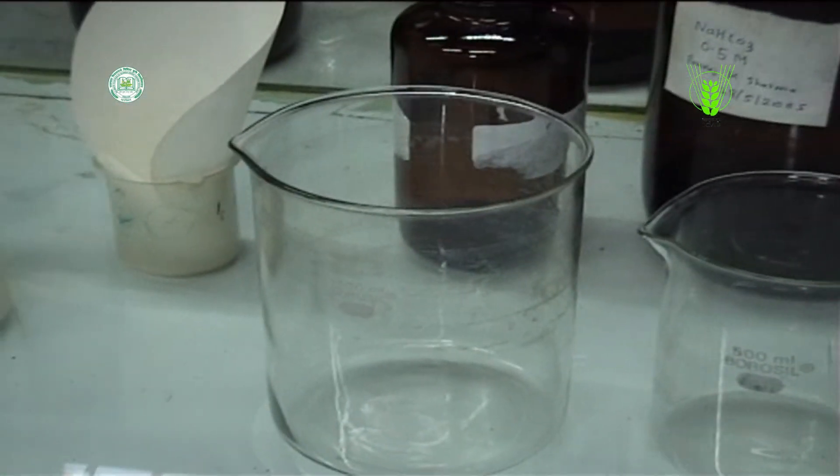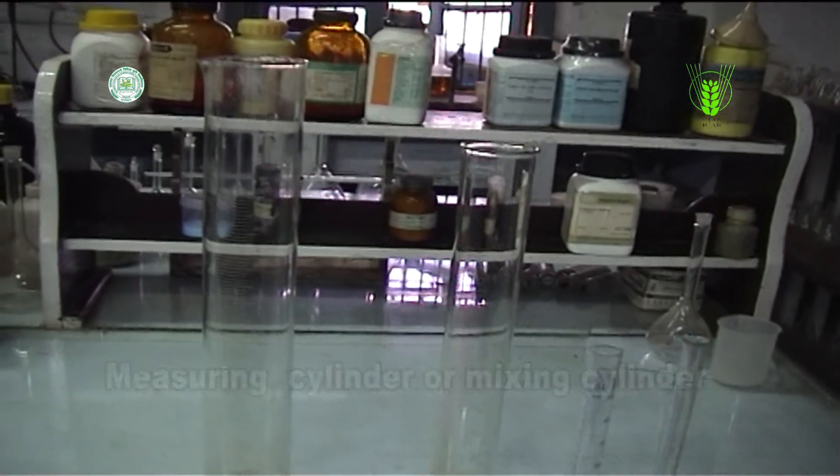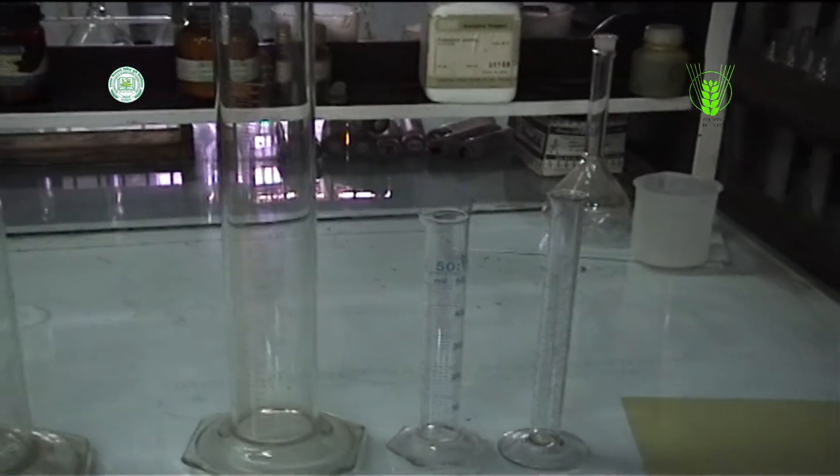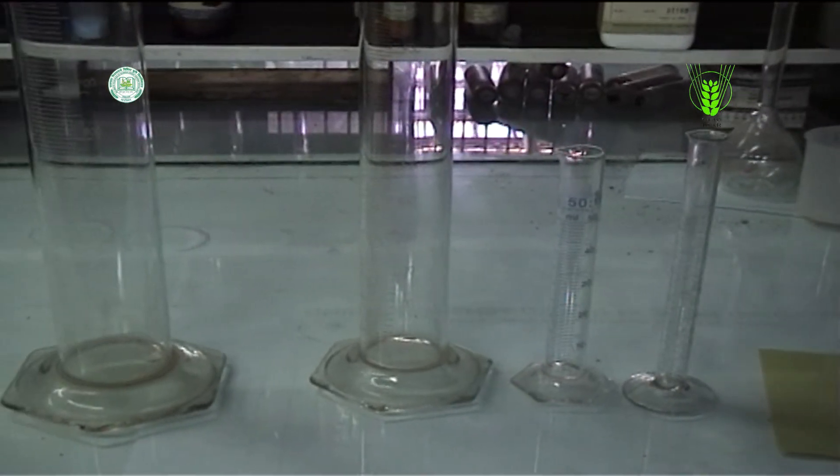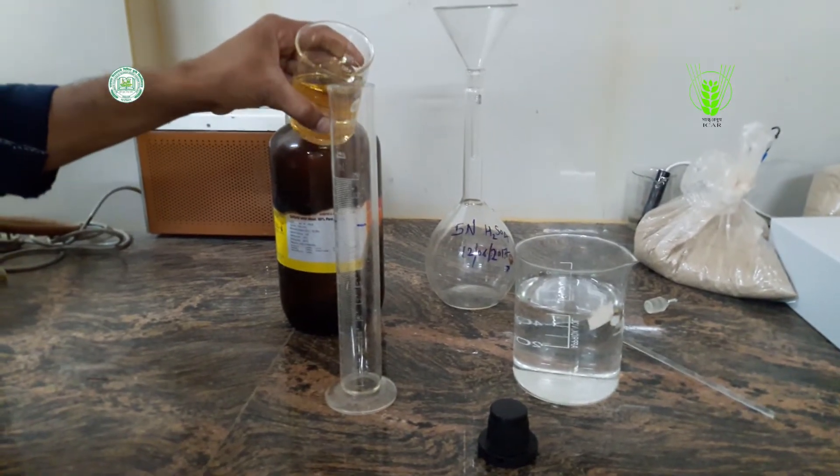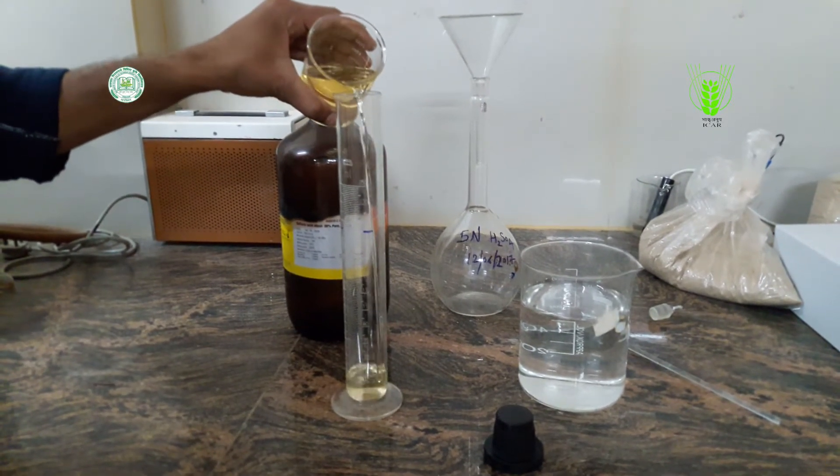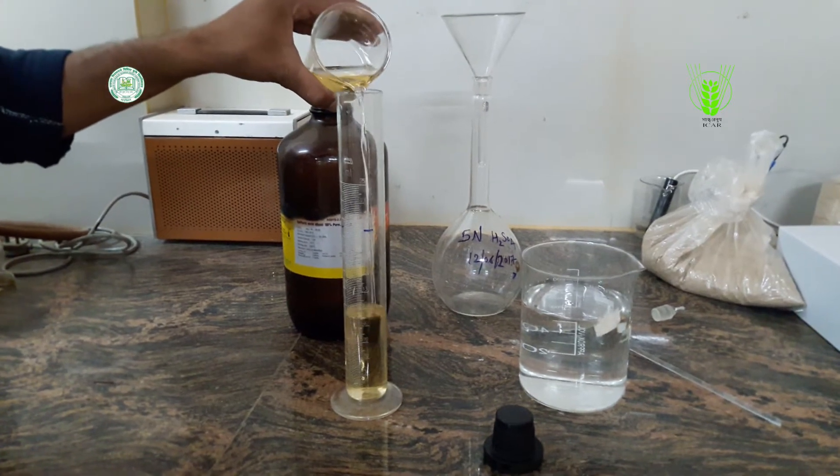Another glassware used in the laboratory are measuring cylinders or mixing cylinders. These are used to measure the volume of a liquid. Graduated cylinders are generally more accurate and precise than laboratory flasks and beakers.